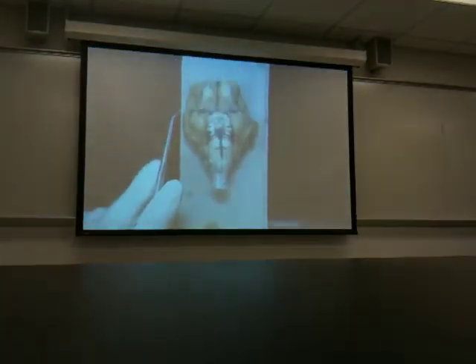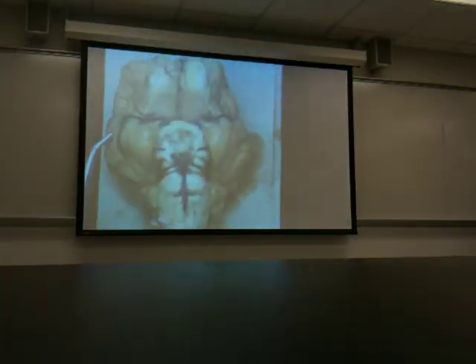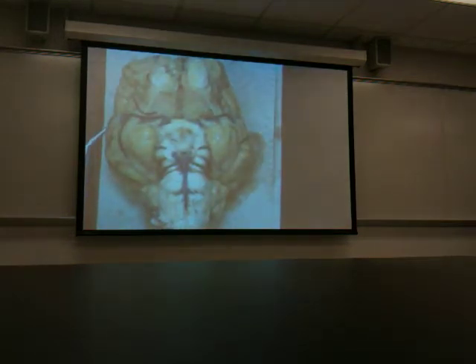And so sometimes it might be a little blurry here, so I'll have to try to get the camera to realize where it's supposed to focus. All right, so we just mentioned.